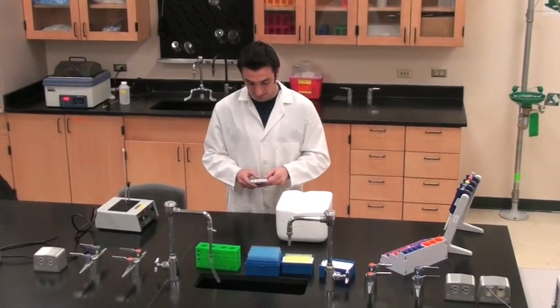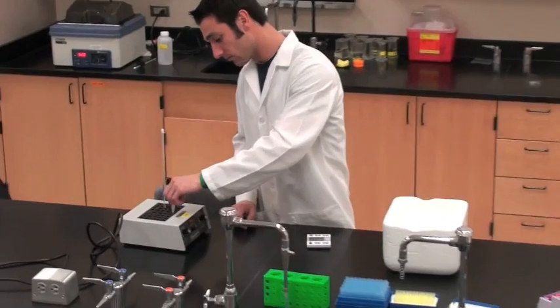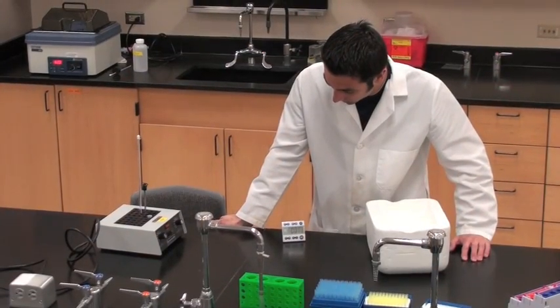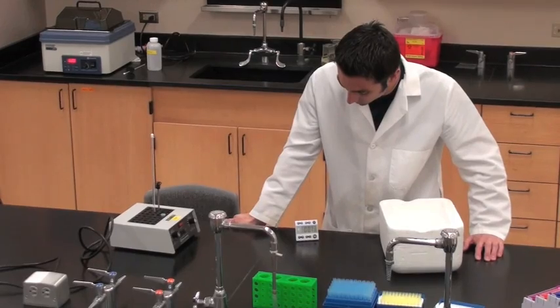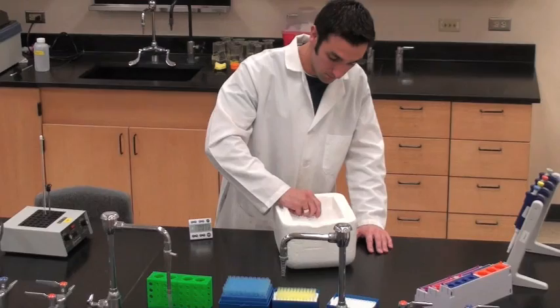After the 30 minutes, quickly transfer the solution to a preheated 42 degrees Celsius dry bath and incubate it for exactly 90 seconds. Do not leave your tube in over this amount of time as it will ruin the reaction. Be careful not to shake the tubes.